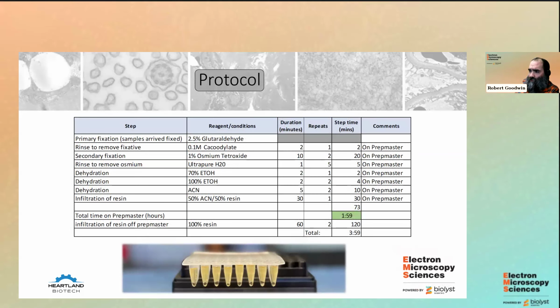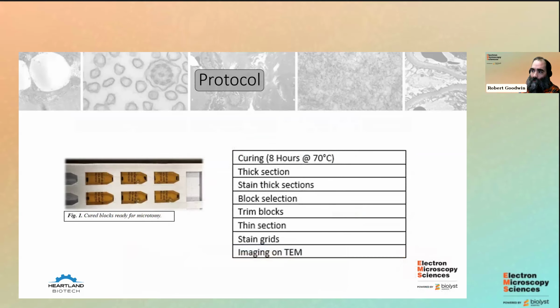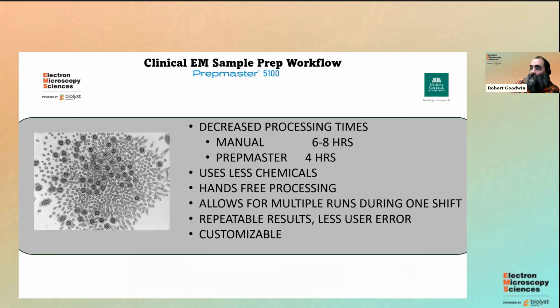And that's just showing that you can do pellets as well in there. Those are cell pellets. The cell pellets we will embed in histogel beforehand, just to keep things intact while everything's moving around. This is just our standard post-processing there, curing, going to sectioning and all that.